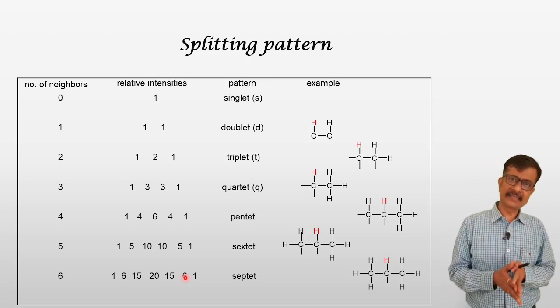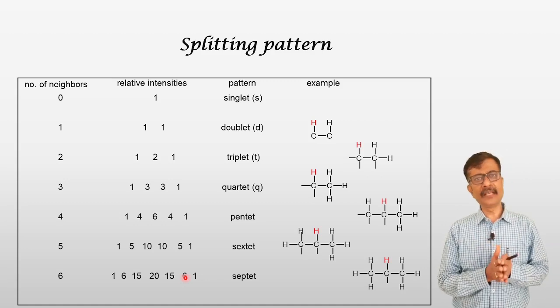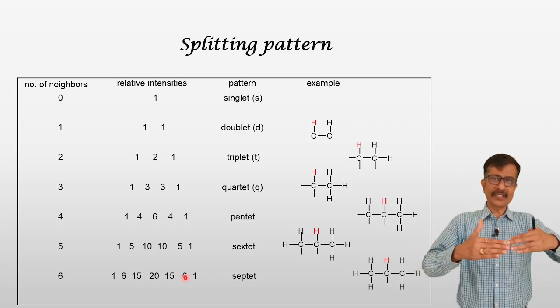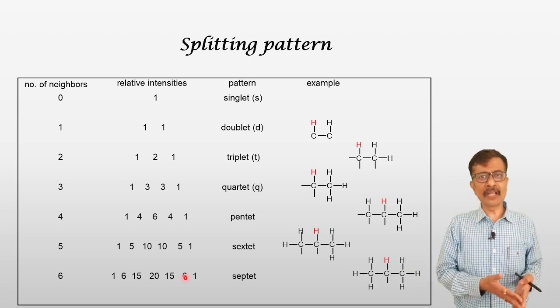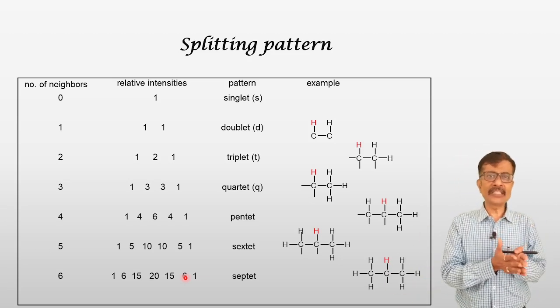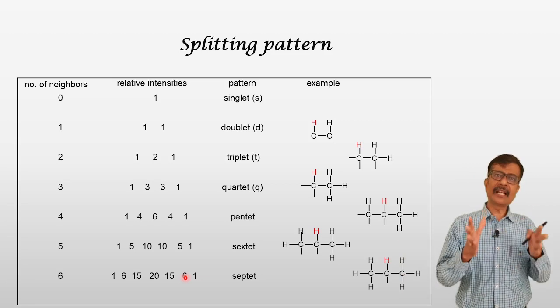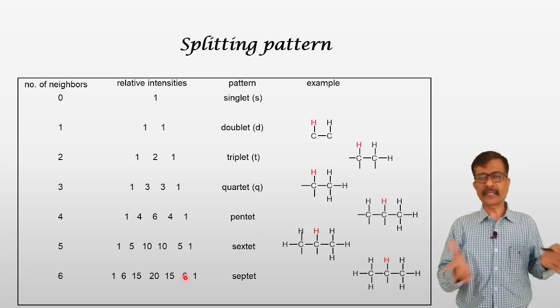So with the help of chemical shift and spin-spin splitting in proton NMR, we can find what the functional group is and how it is arranged. By combining this with the molecular weight from mass spectroscopy, and with support of IR spectroscopy for confirming the functional groups, we can reach the structure of the compound after spectral analysis.